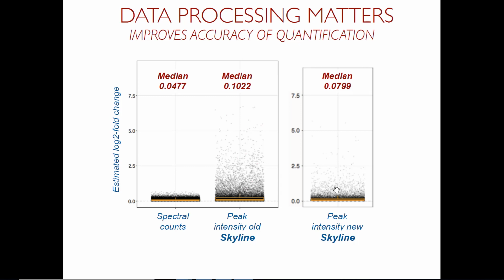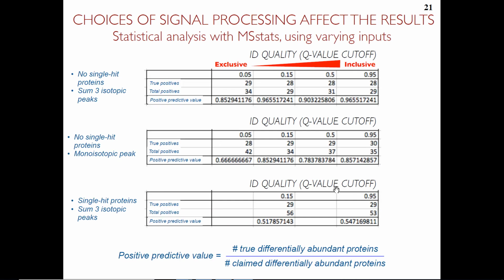So data processing matters. This is to say that we will start from Skyline reports or OpenMS reports and so on, but the upstream steps are extremely important. And so then, yes, please.